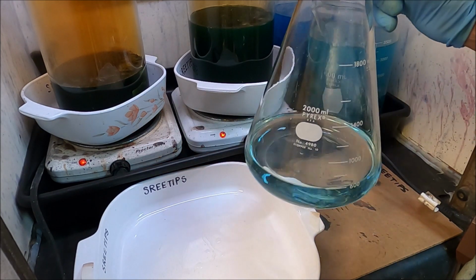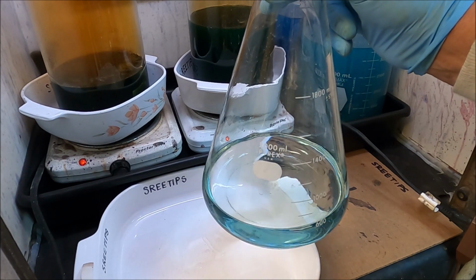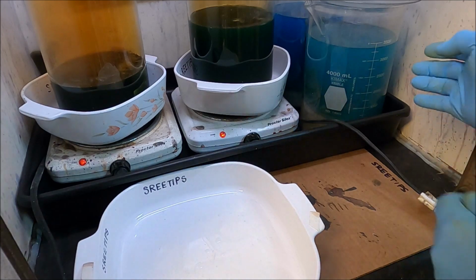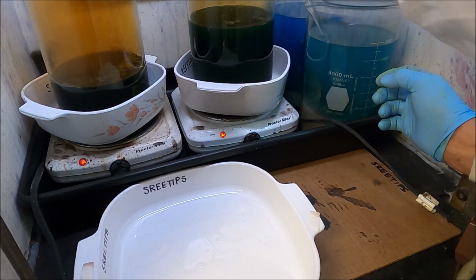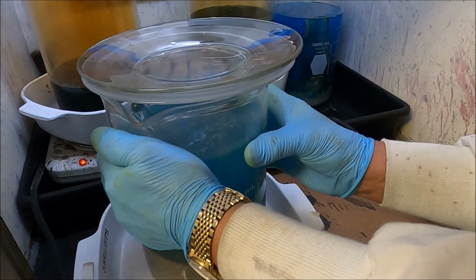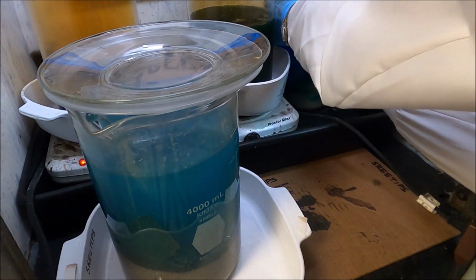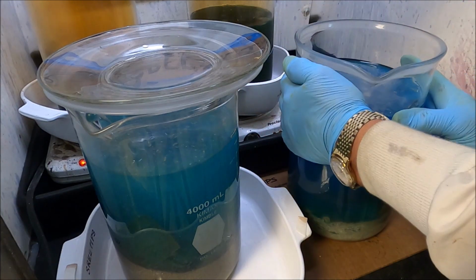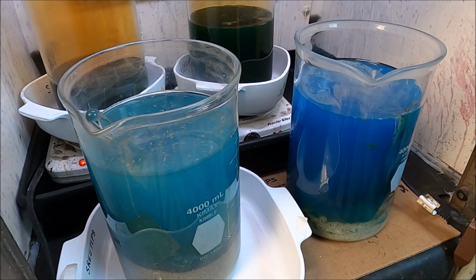This is some more of the silver bearing solution that I drew off earlier in this video. What I'm going to do now is pull up our beakers here that have the copper in them, and I'm going to add that material or that solution to these beakers to get that silver that's in that solution in the flask cemented out onto the copper in here. I'm going to add this right to it.